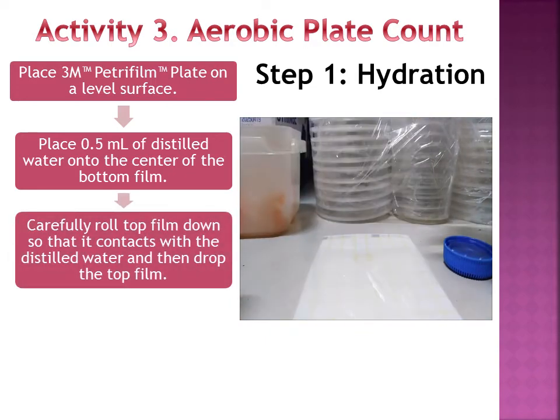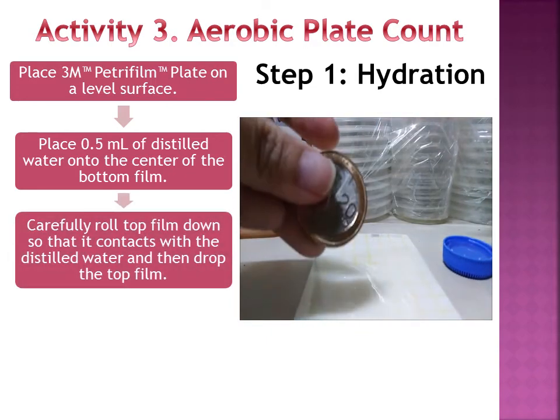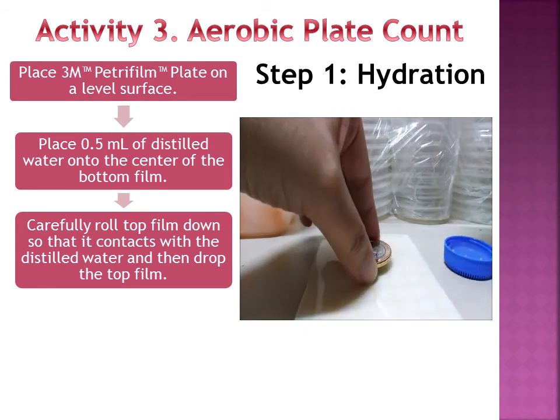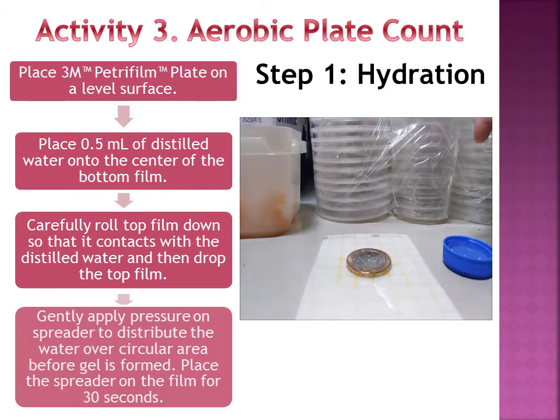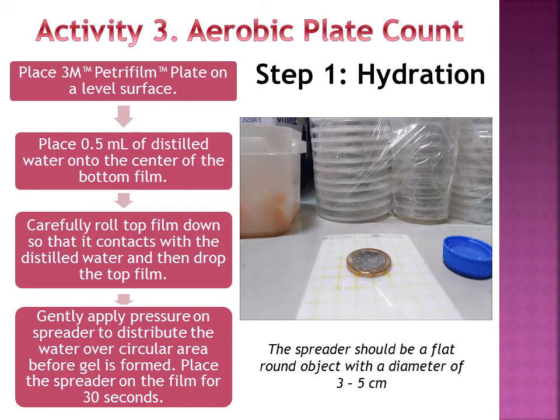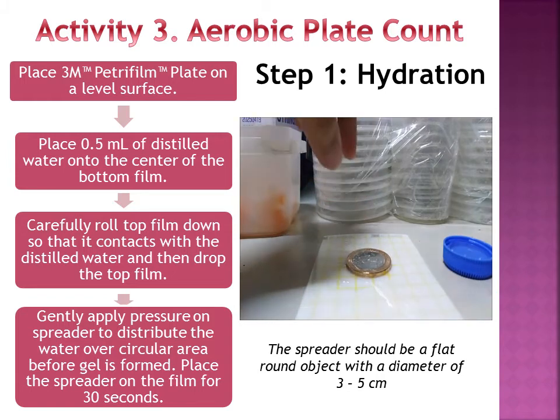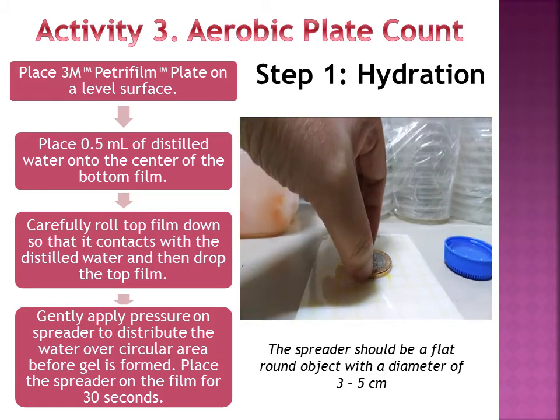Carefully roll the top film down so that it contacts the distilled water, then drop the top film. Gently apply pressure on the spreader — in this case a 20 peso coin — to distribute the water over the circular area before the gel is formed. Place the spreader on the film for 30 seconds. You can use any spreader, but it should be a flat round object with a diameter of 3 to 5 cm.